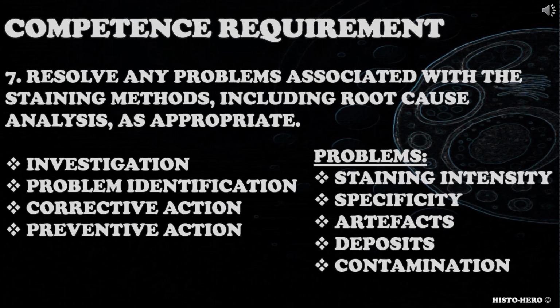The seventh competence requirement is for you to resolve any problems associated with the staining method, including root cause analysis, as appropriate. What are the common problems associated with relevant demonstration methods? How would you resolve them? How would you record them?